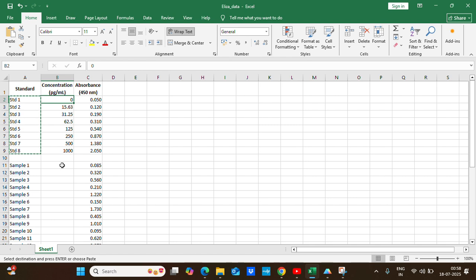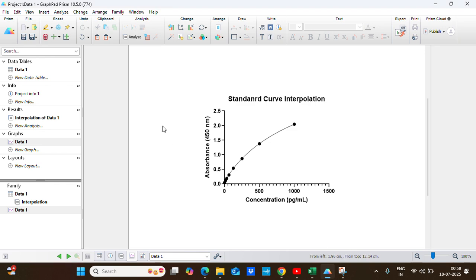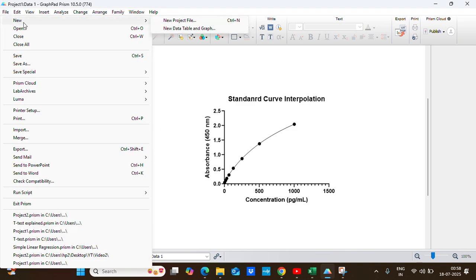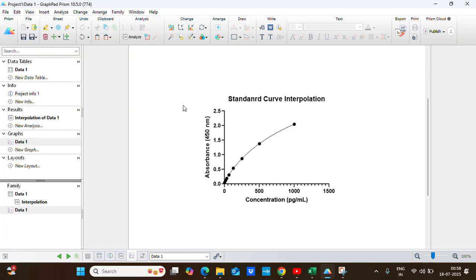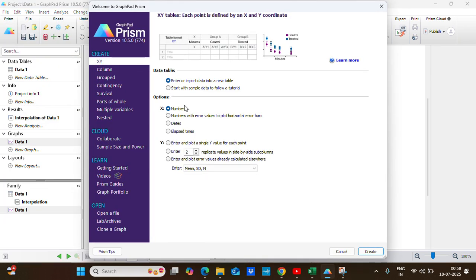So now let's go to GraphPad Prism. We will take a new file, new project file. We will choose the XY data type, and in the Y option we will choose enter and plot a single Y value for each point.